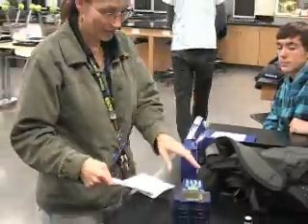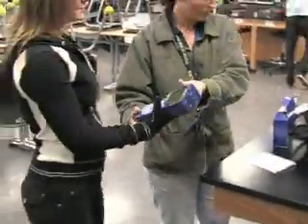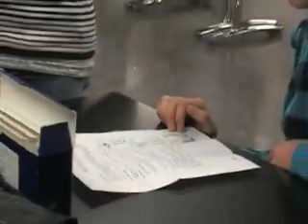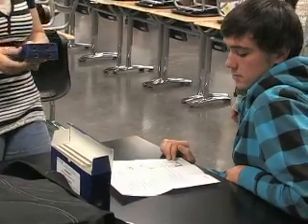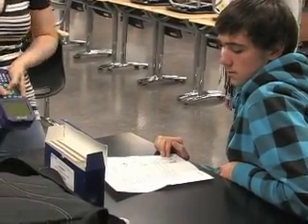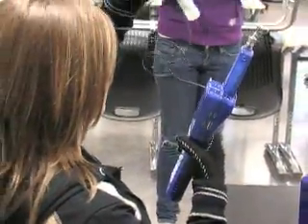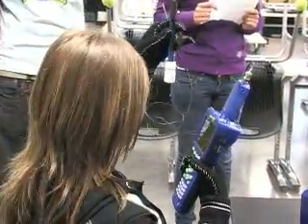All right, you guys, here's our handy-dandy GLX. It's Friday afternoon at 3:45, and most students are on their way to the game or on their way to their Xboxes at home. So why are these 6 students voluntarily staying after school? All of us are going to go down to our water detention pond at the south end of the campus and take tests on the quality of the water.